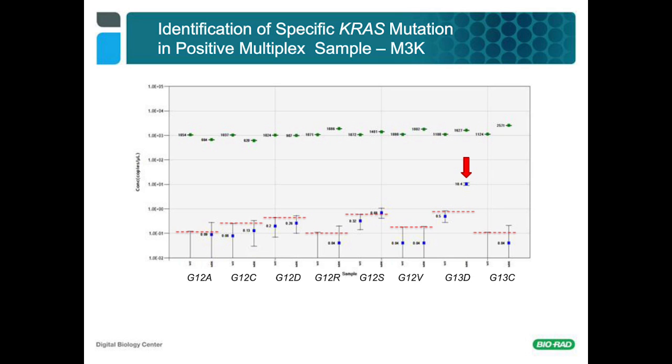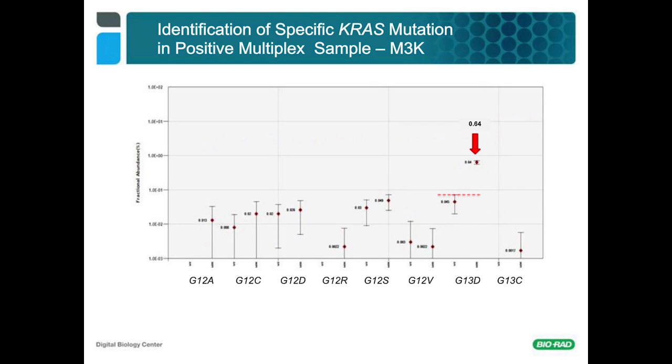Since we did not have enough sample left to screen all the individual mutations, and we had already determined the absolute concentration of the sample, we used the SsoAdvanced PreAmp Supermix from Bio-Rad to generate enough sample to identify the individual mutation type. There was some amplification bias, which altered 1% mutant to about 0.64%, as would be expected with preamp. But since we had an absolute measurement from the initial screen, a qualitative answer was acceptable.